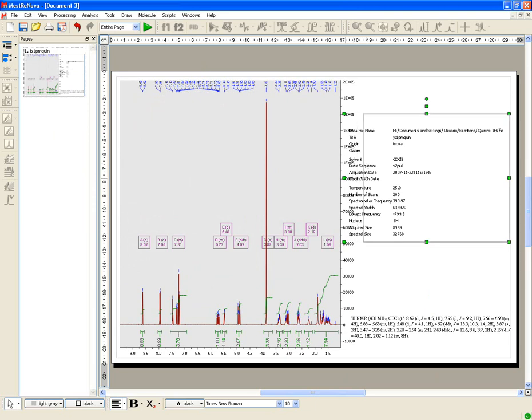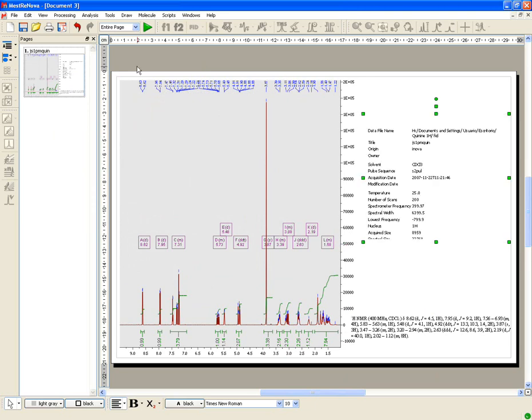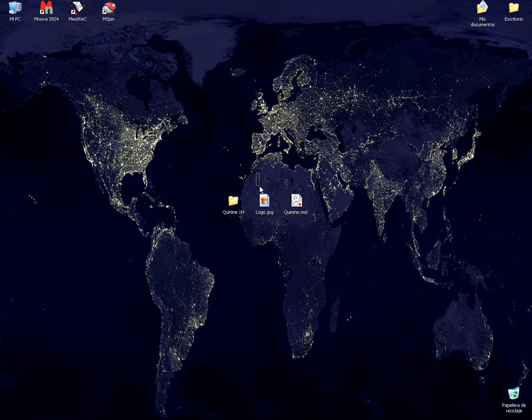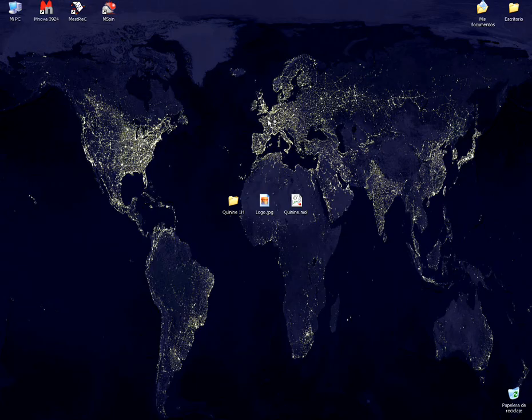You will easily be able to import pictures and MOL files just by dragging and dropping. You can also copy molecular structures from ChemDraw, IsisDraw, or ChemSketch.